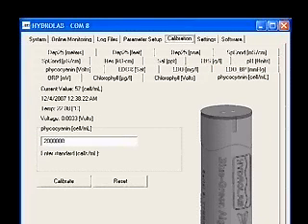You will see a picture of the fluorometer, as well as the current cells per liter, the date and time, the current temperature, and the voltage reading of the sensor.